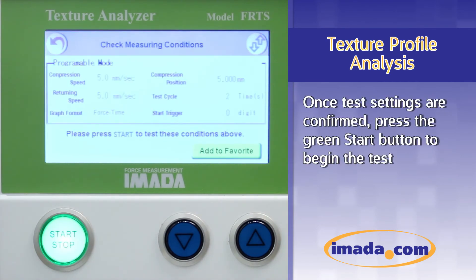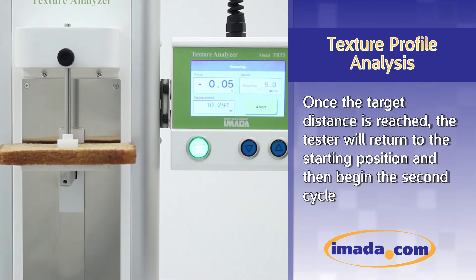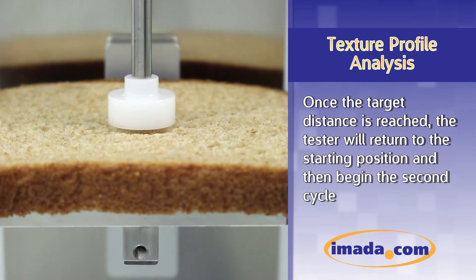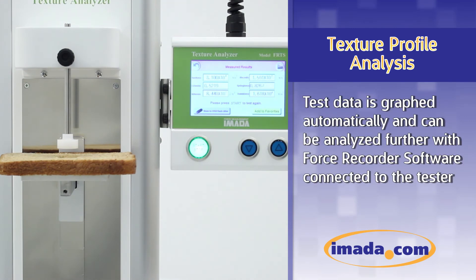Once test settings are confirmed, press the green start button to begin the test. Once the target distance from the sample table is reached, the tester will return to the starting position and then begin the second cycle. Test results are shown on the display once the test is completed. Test data is graphed automatically and can be analyzed further with Force Recorder software connected to the tester.